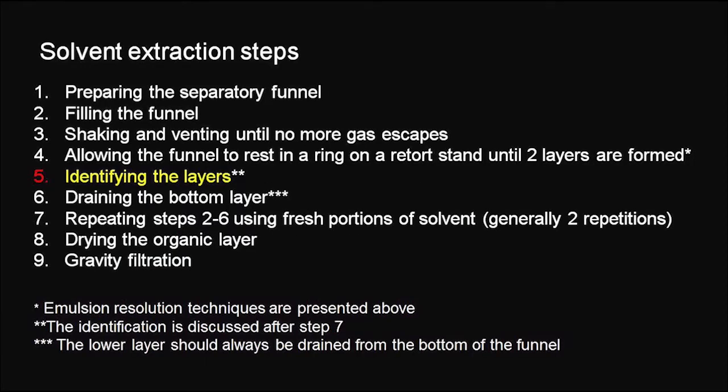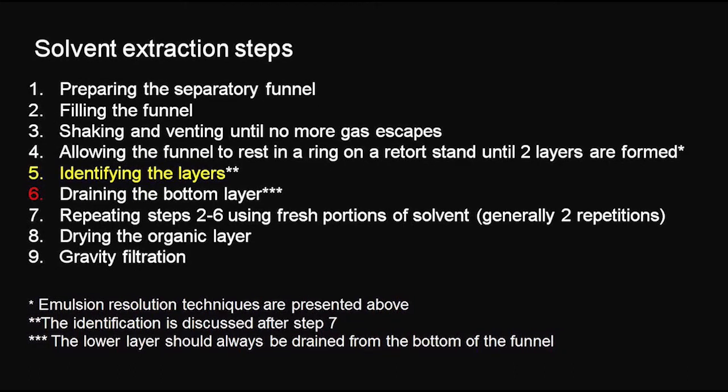Then, we need to know which layer is organic and which one is aqueous. The layers can be identified using a simple technique as demonstrated later in this video. Only the bottom layer should be drained through the stopcock. This allows us to minimize contamination as only one layer touches the stem of the sep funnel.